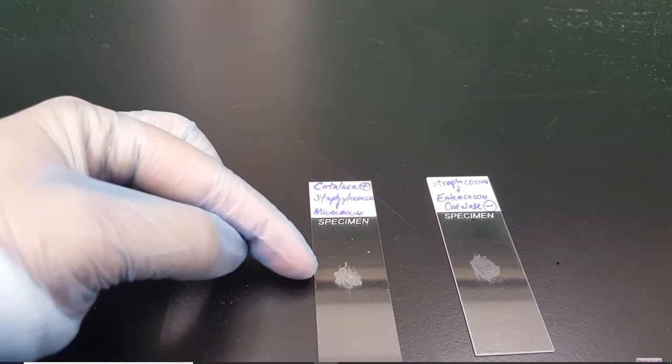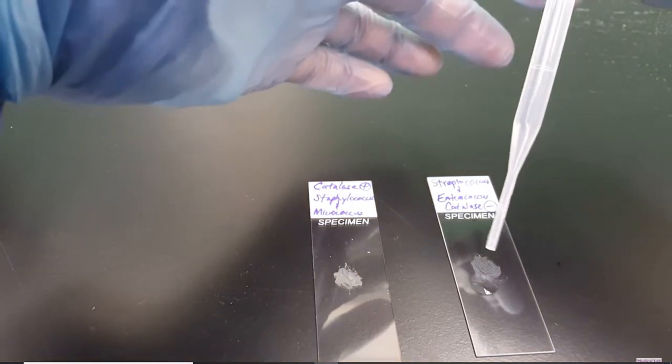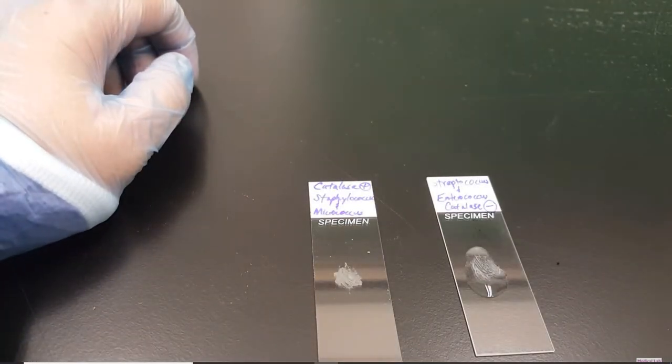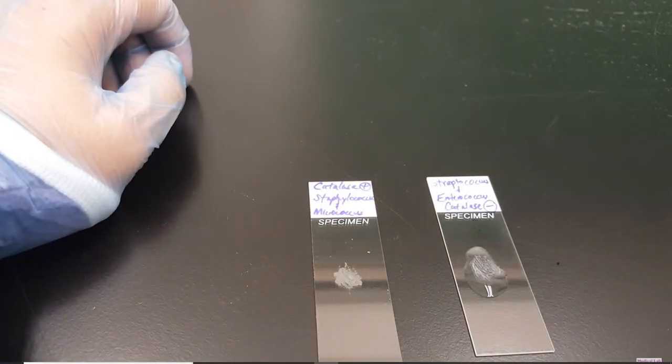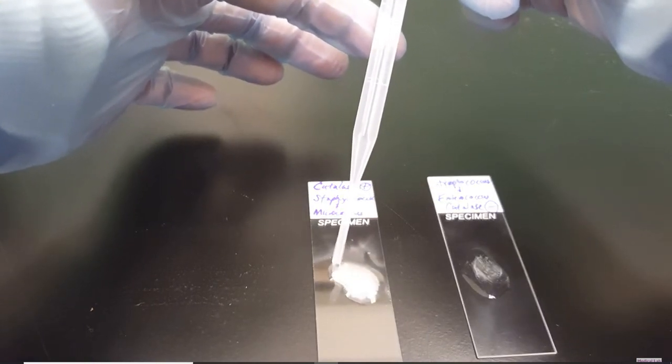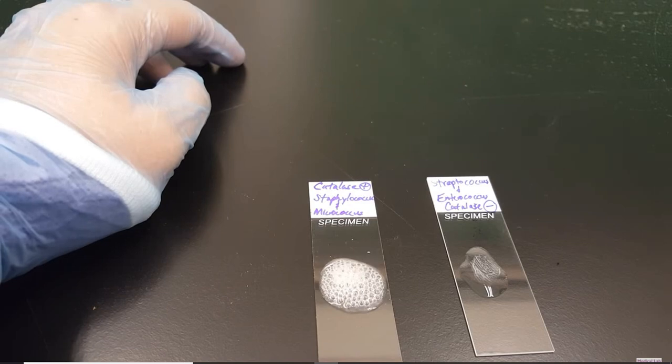So I'm going to add my hydrogen peroxide and look for bubbles. Okay, so as expected, the Streptococcus does not show any bubbles. On the video it looks really white, but there aren't any bubbles. Whereas on the Staphylococcus aureus, look at all those bubbles. So this is a positive test here for staph, and this is a negative test here for strep.